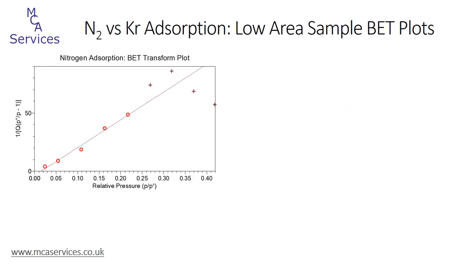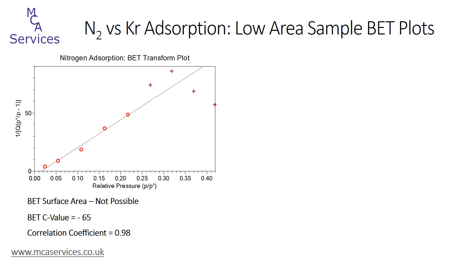Looking at the BET transform plots of each isotherm and the resulting BET surface area data, we can see that for nitrogen adsorption it's not possible to generate reliable data. Even using just the lowest five relative pressure data points, shown as the red circles, the BET C value is negative and the correlation coefficient is very poor. If we were to use only the lowest two relative pressure data points we could obtain a positive C value of 625 and a perfect correlation coefficient, but in this case the BET surface area is calculated to be 0.027 square meters per gram and must only be considered completely unreliable.